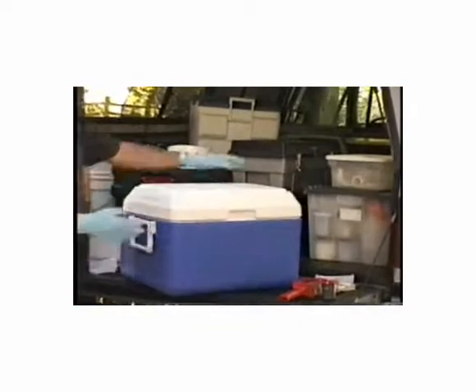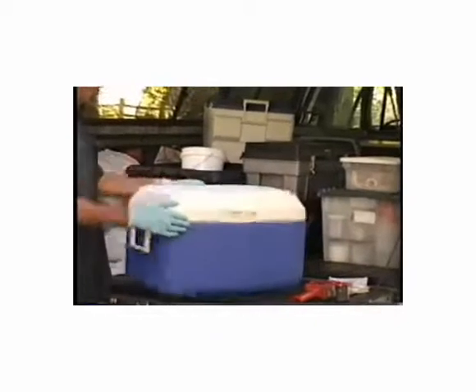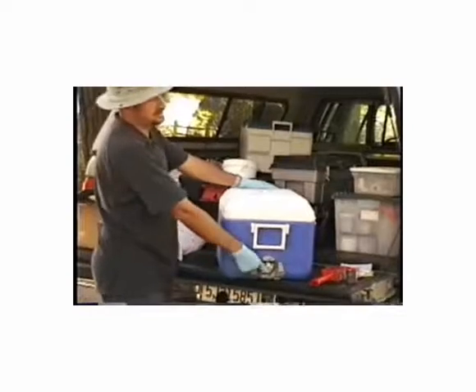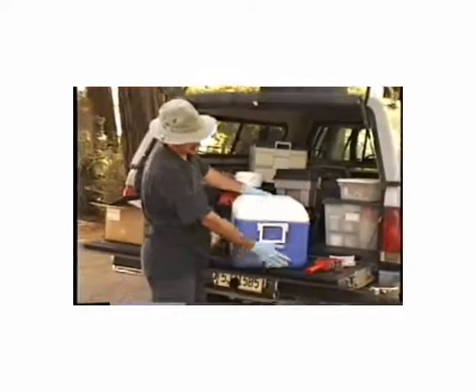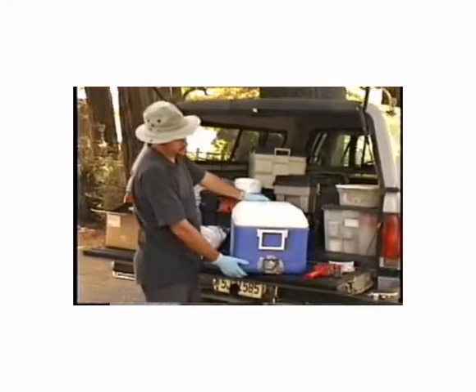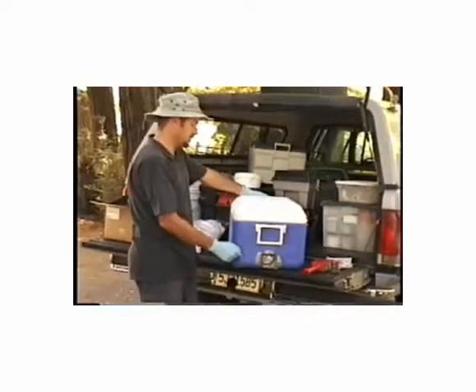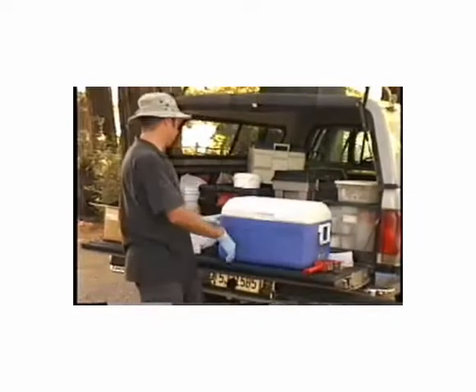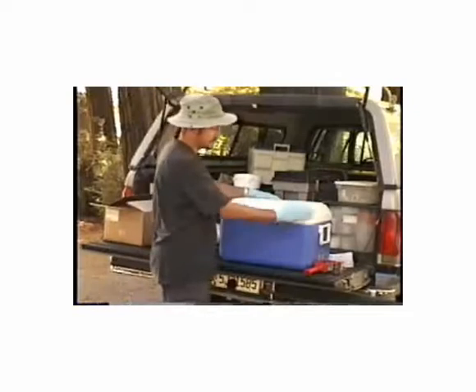We then want to securely tape the cooler closed, also making sure that the spigot on the cooler is also taped closed in case during shipping it could come open and leak water. If coolers do leak water during shipping, the shipping companies usually stop shipping them, and they will hold them in some shipping facility, and the samples will not arrive to the desired laboratory.